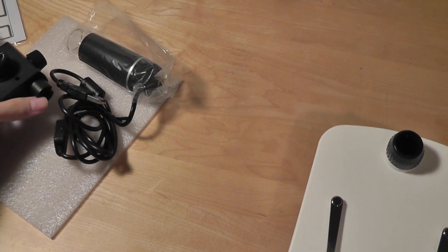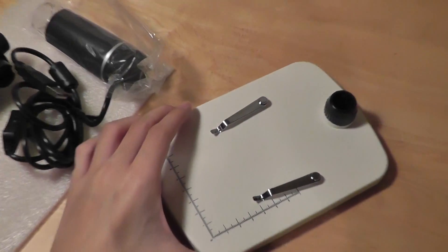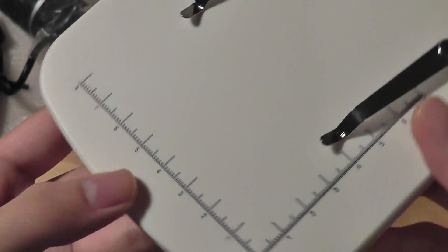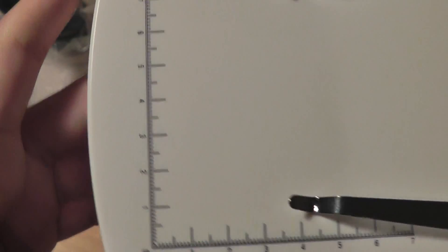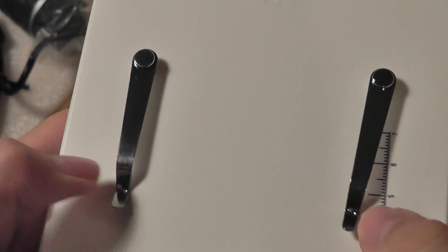The base is relatively heavy because it has enough weight so it doesn't really move around on any desk or surface. It's crafted out of plastic and it's a relatively sturdy piece of plastic, so it feels pretty good. On the bottom, you have access to some measurements for you to get more accurate readings in terms of the size of the specimen or whatever you're trying to measure.